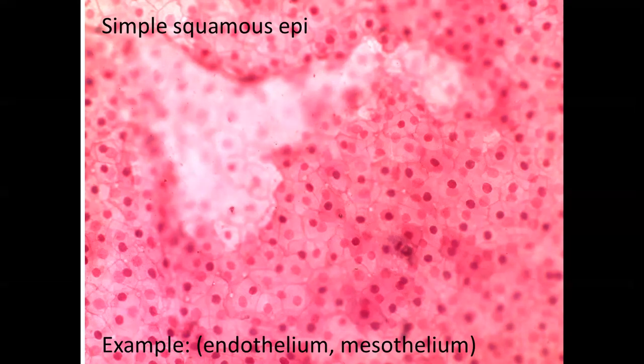This laboratory is about the covering epithelium. A characteristic feature of the covering or lining epithelium is that the cells consist of one layer or several layers. The cells are separated from the connective tissue by a basement membrane. Another characteristic feature of the epithelium is that it is avascular, with no blood vessels, so they are nourished by what? By diffusion from the underlying connective tissue.